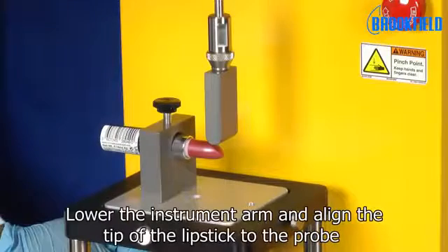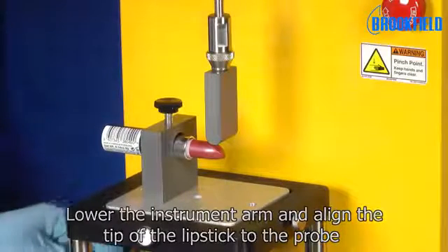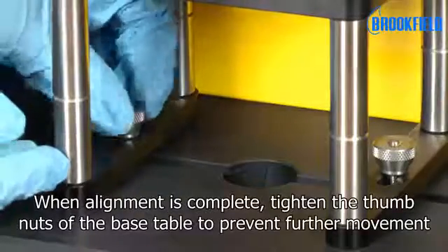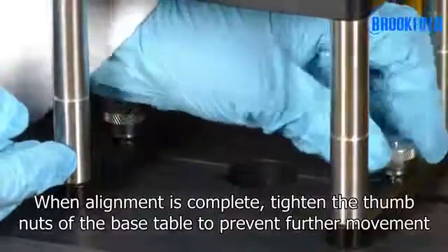Lower the instrument arm and align the tip of the lipstick to the probe. When alignment is complete, tighten the thumb nuts of the base table to prevent further movement.